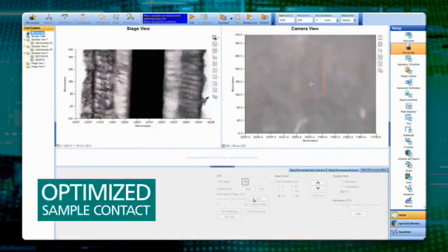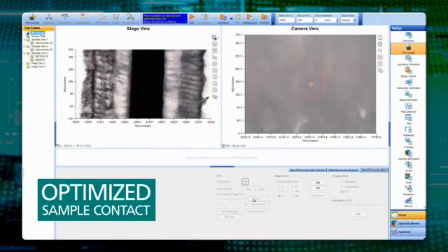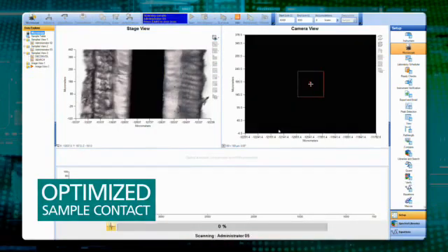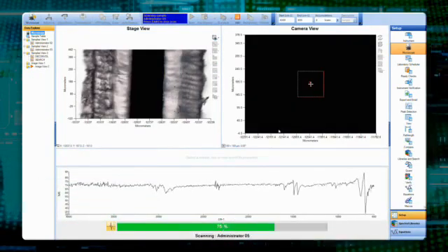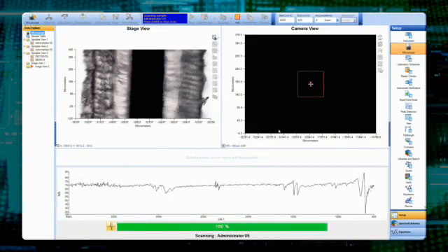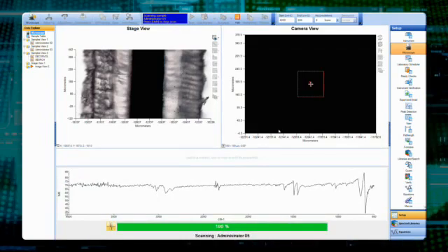Remove the need to section samples before measurement. Fully auto-driven from software, no special alignment is needed, with multipoint pressure adjustment for optimum contact to ensure best data.